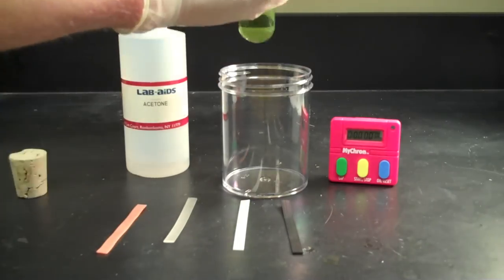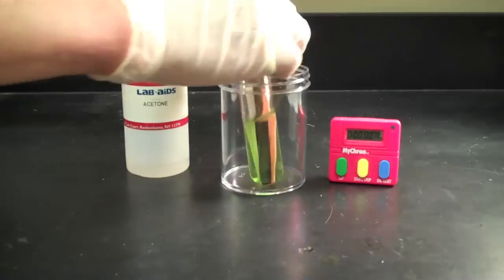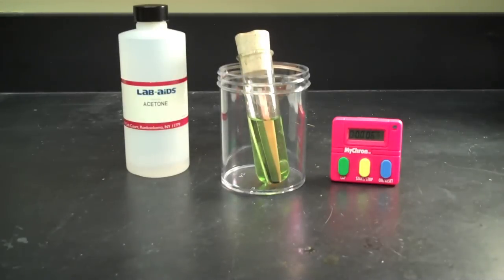Again, we'll speed up the process where we place each strip of plastic in the acetone and let it soak for five minutes.